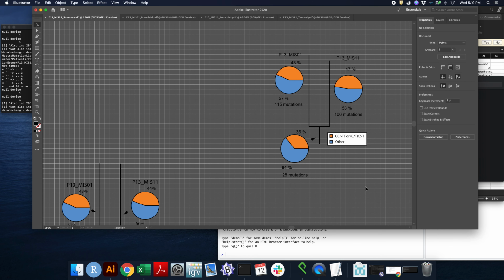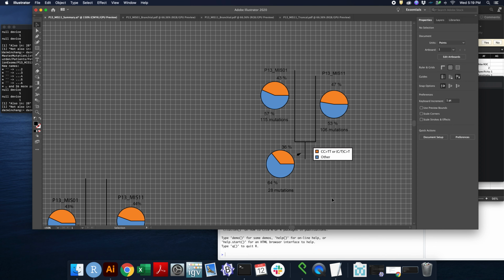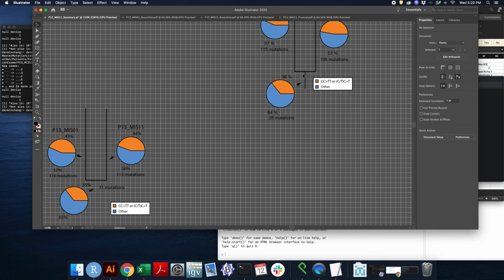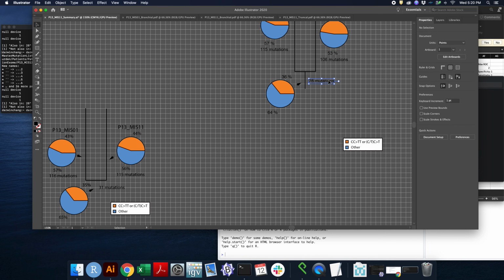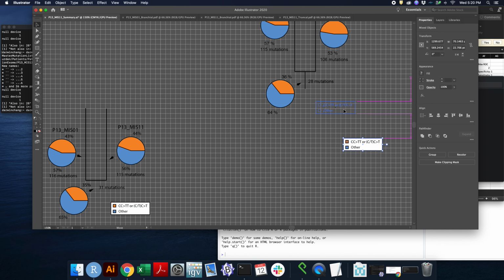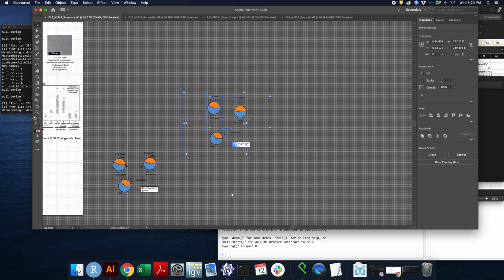Okay, that should be it. Let's just really quickly carry this over a little bit. Oh, right. Since the truncal is usually, or sometimes is a little bit short, just gotta have the number of mutations a little bit closer. And then we'll drop the legend down here. Copy and paste the whole thing.